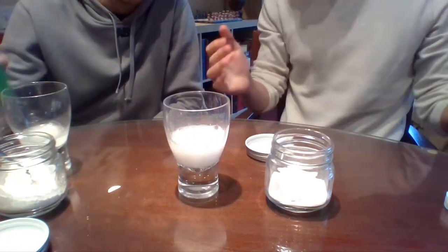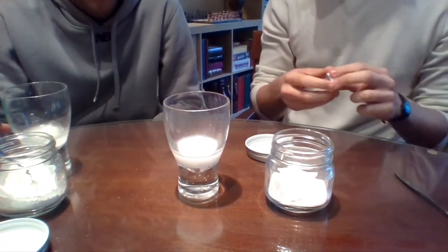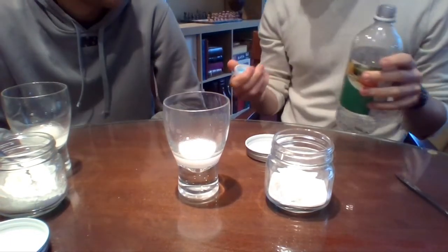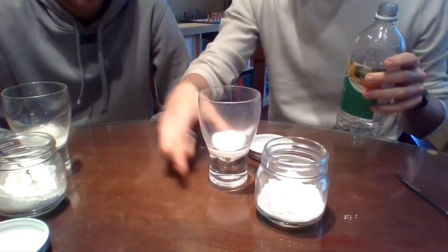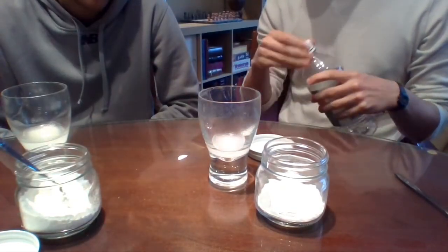Oh. Alright, don't add too much. Just don't want it to bubble over and make a mess. I would say that's a pretty clear result, right? Yeah, and you can smell it too. That's the other thing. So we started out with a problem. We had said these two different jars looked very similar, and we couldn't tell which one of them was which. Yep. And now we've answered that problem. What do you think, which one's which?